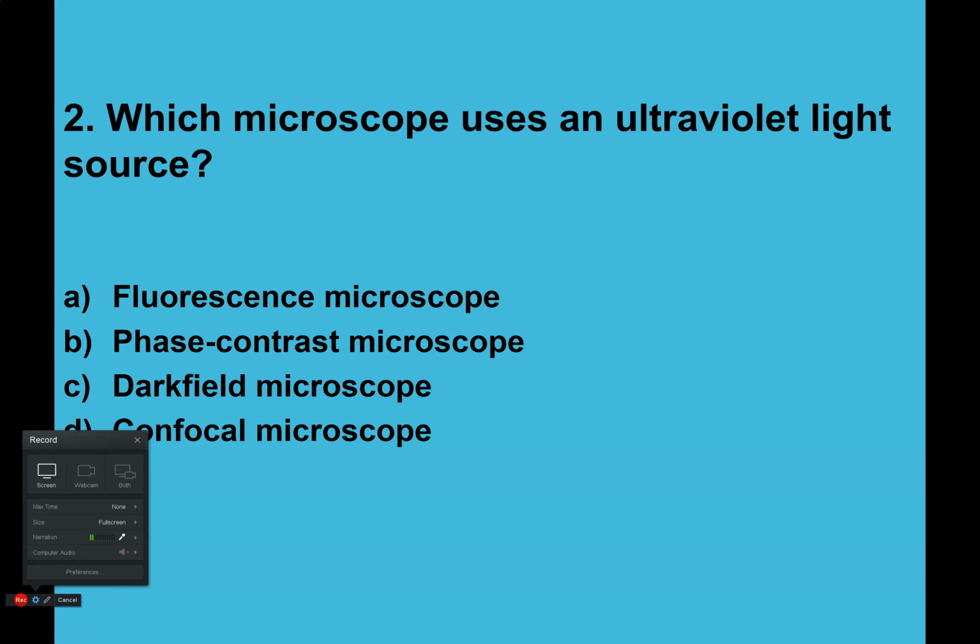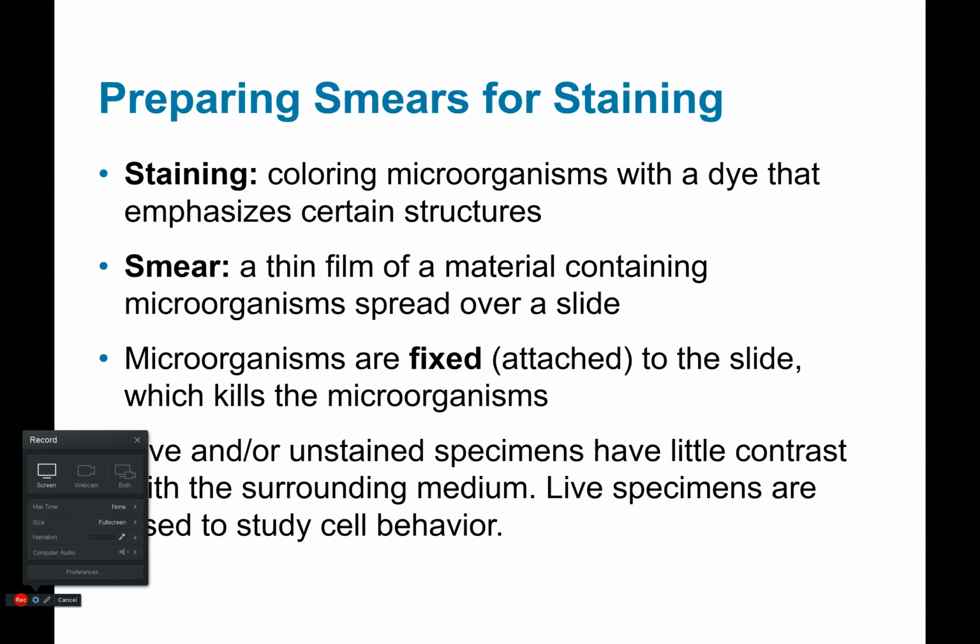So here's a question that you will see right now in the recording. Which microscope uses an ultraviolet light source?